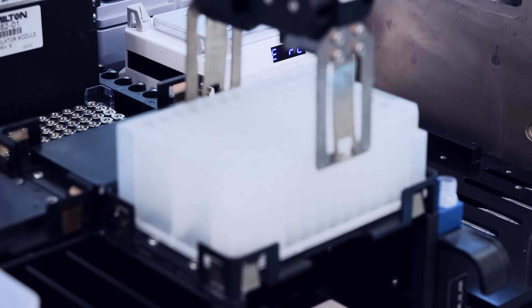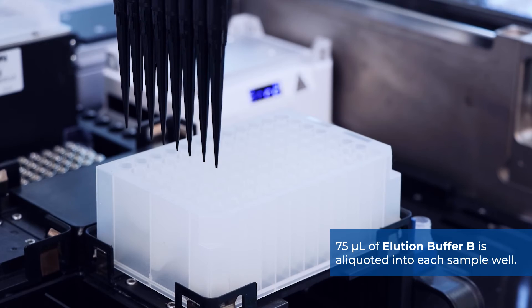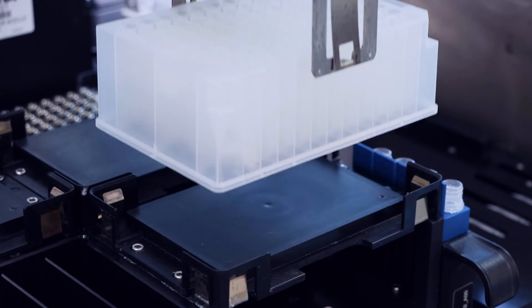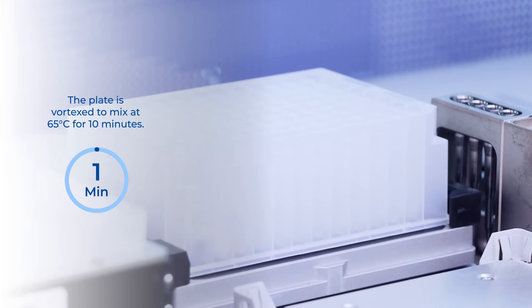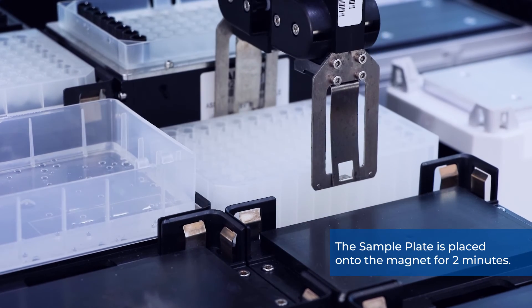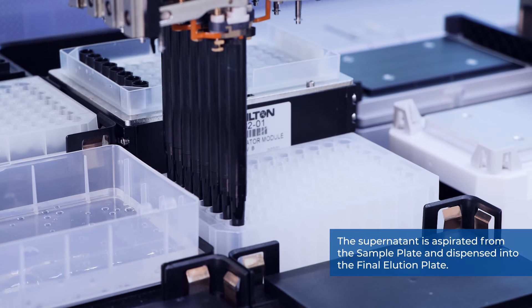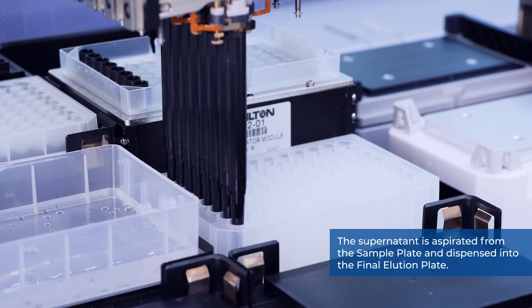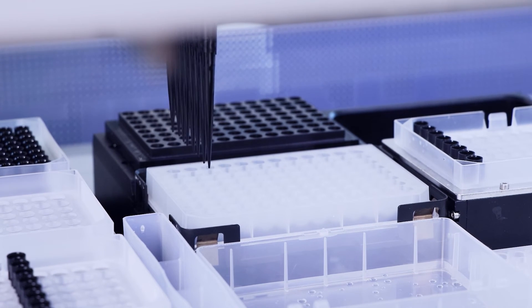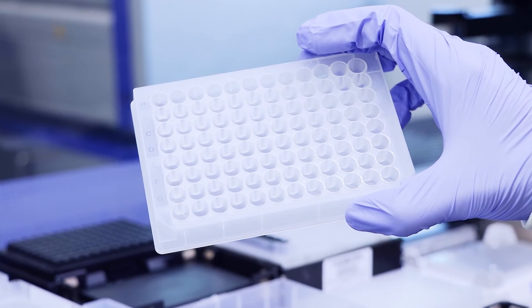The sample plate is transferred to the starting position, and 75 microliters of elution buffer B is aliquoted into each sample well. The sample plate is transferred to the heater shaker and vortexed at 65 degrees Celsius for 10 minutes. The sample plate is then placed onto the magnet for two minutes. The supernatant is aspirated from the sample plate and dispensed into the final elution plate. The purified DNA can now be removed from the Hamilton Vantage for downstream analysis.